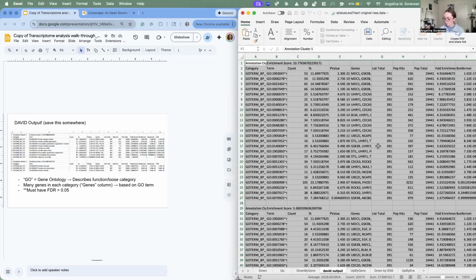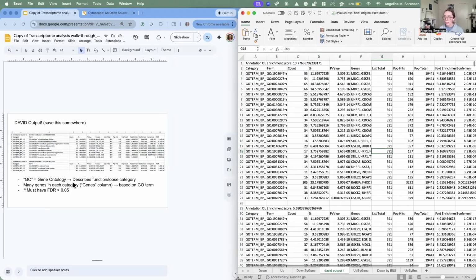Yeah, that's all I'm going to call it. David output, I'll go 1 in case I do this again.